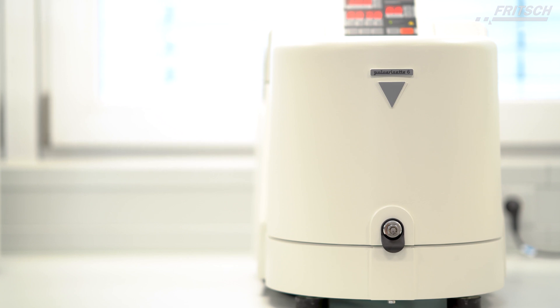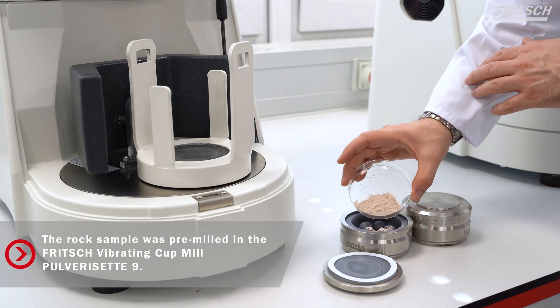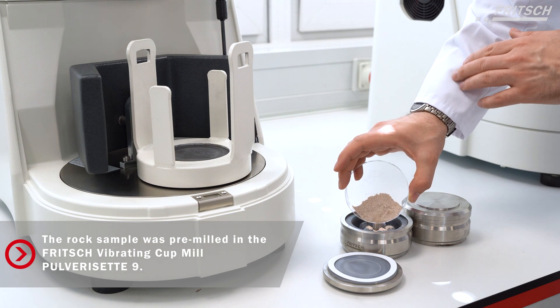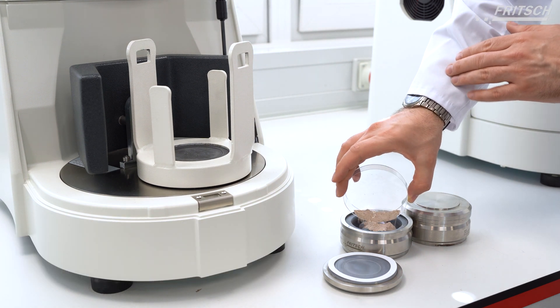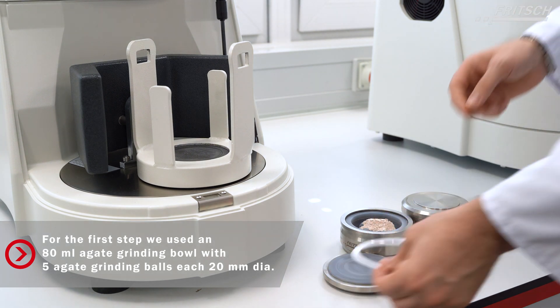In this application, we will grind a pre-milled rock sample in an agate grinding bowl with agate grinding balls. In this first step, we used an 80 milliliter grinding bowl with five grinding balls, each measuring 20 millimeters in diameter.